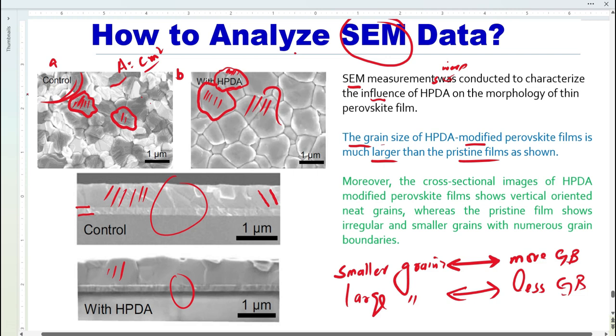In this particular surface area, if we have small grains, this means that there will be many grain boundaries. When we want to occupy this with larger grains, we have to increase the size. When we increase the size, we decrease the grain boundaries. And grain boundaries are an unwanted phenomenon because cracks occur there, and humidity, foreign moisture, water can enter the device, etc. So fewer grain boundaries are better.